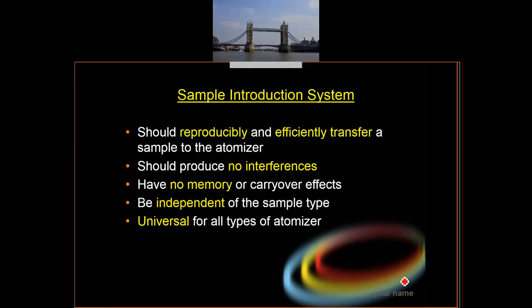The next compartment, the next point that we need to know is the sample introduction system. This is the one that we have the pipe for, just now. We put our sample in a beaker.